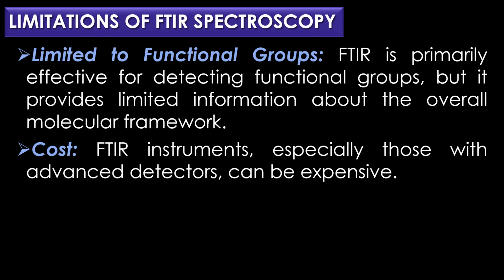The fifth and final limitation is cost. FTIR spectroscopy instruments, especially those with advanced detectors, can be expensive.